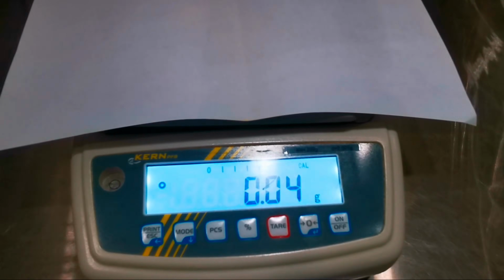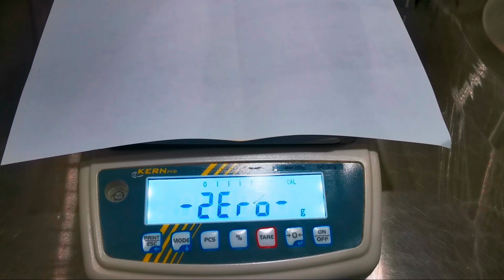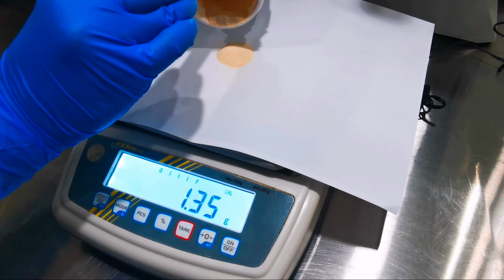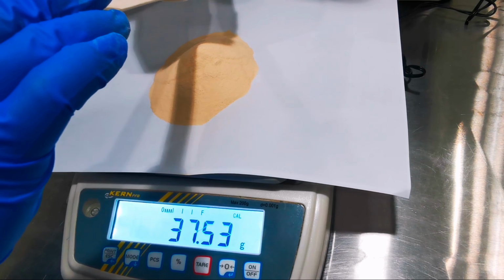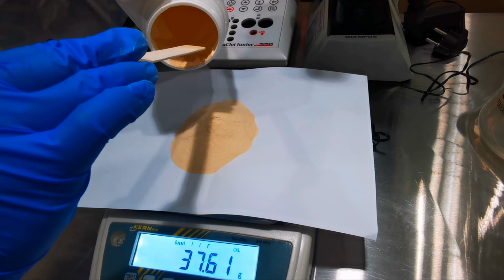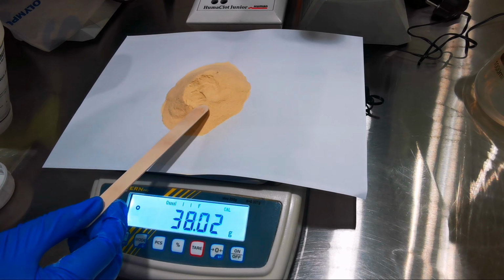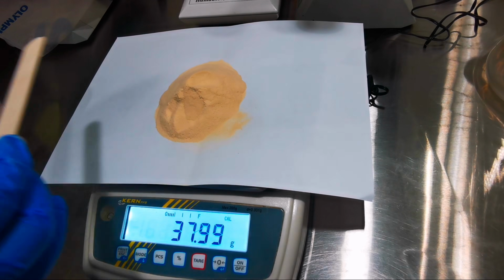First thing to do is to put the clean coupon bond on the weighing scale and set the weighing scale to 0 grams. Pour the agar little by little until you reach your desired amount, which is 38. For me, this is the hardest part of doing the agar because it's so hard to make it exactly 38 grams.